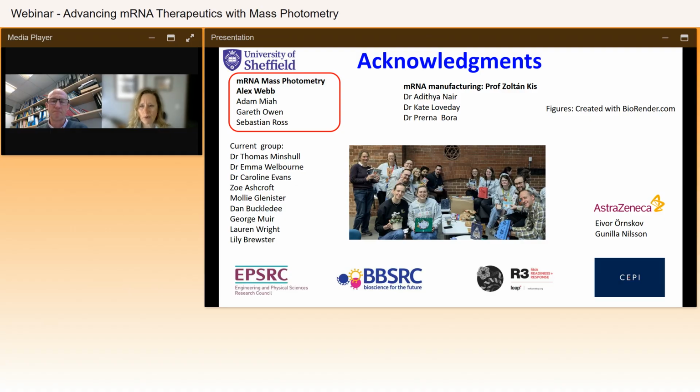Okay. And so again, a similar question about concentration. What concentration range, and load volume or time, works best to minimize surface crowding and artifacts? Yeah, so again, it's similar to that. Within that broad range of low concentrations, you don't want too high concentrations because of crowding and artifacts, and you really want to minimize those unbinding events. But obviously, with too low a concentration, you don't get the number of counts or the single particle analysis. So there is a balance. You don't want to go too high, and any lower, and you just don't get the sensitivity.